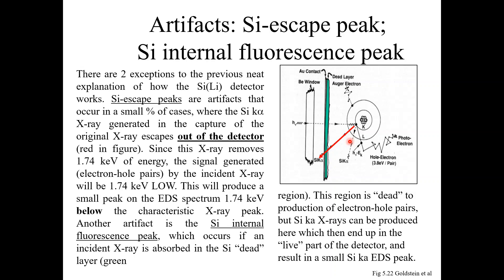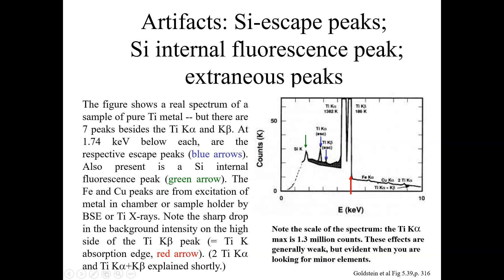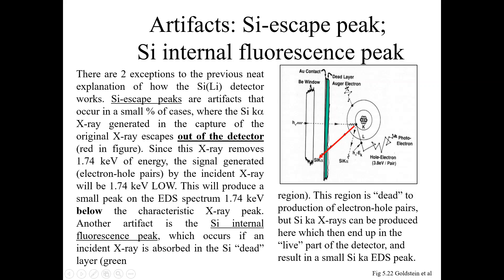Another artifact is the silicon internal fluorescence peak, which occurs when the incident x-ray is absorbed in the silicon dead layer — the green region shown on the slide. That region is dead to the production of electron-hole pairs, but silicon K-alpha x-rays can be produced there, which then end up in the active part of the detector and result in a small silicon K-alpha EDS peak, indicated by the green arrow.